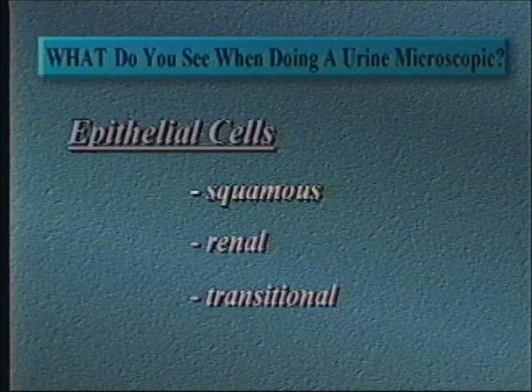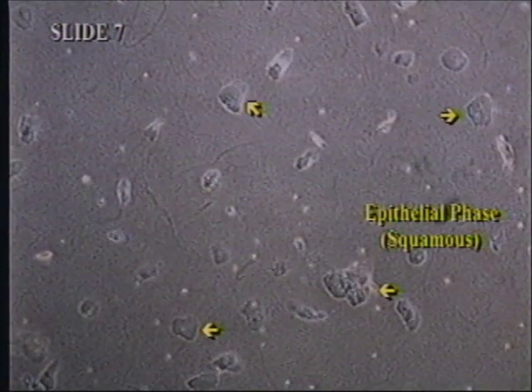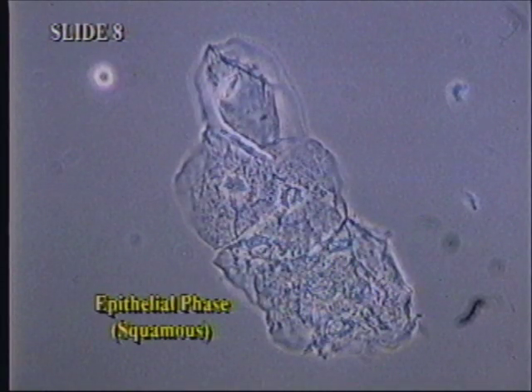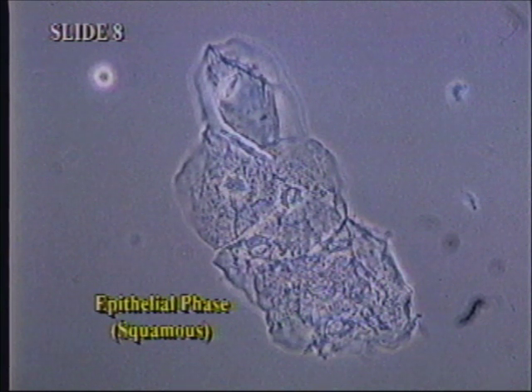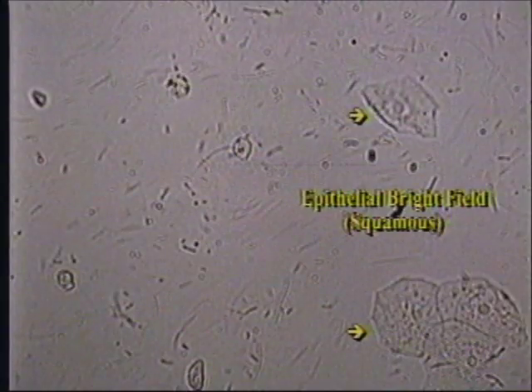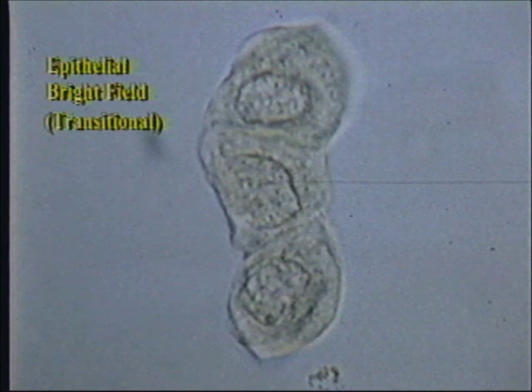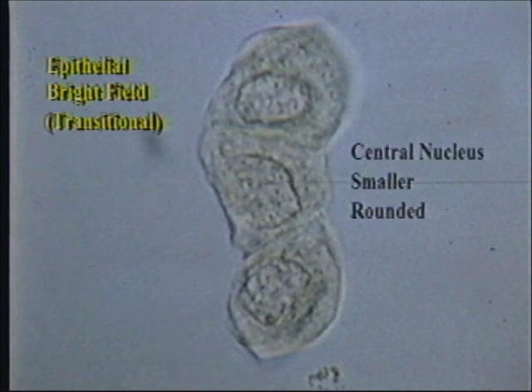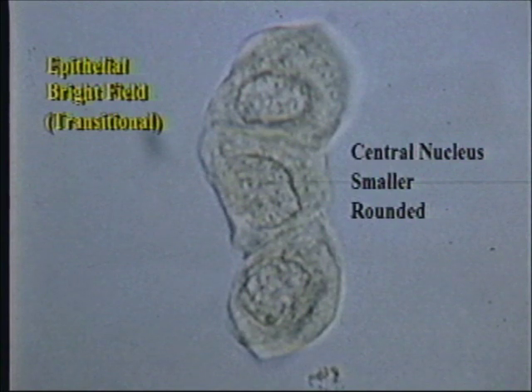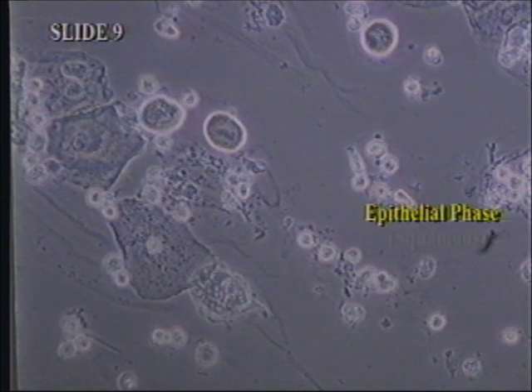Let's look at some epithelial cells. There are three types that need to be recognized and reported: squamous, renal, and transitional. The first are squamous epithelial cells — this is a low power view under phase, and here is a higher power view. They are large, irregularly shaped cells with a small nucleus. It is not a significant finding to see these cells in sheets or clusters. The second type to be differentiated is the transitional epithelial cell. Transitional cells have a more central nucleus and are smaller and more rounded than squamous cells.